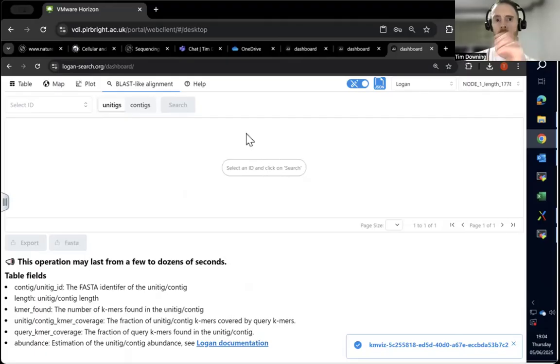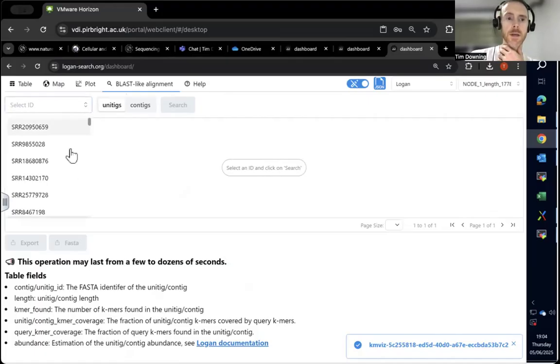So you can see how Logan can tell you more, and this is in addition to the other data in the other databases that are widely known, as well as the typical pathway level analysis that you could do. It's just a different perspective to harness the abundance of information that's available. And so you could take all these identifiers and do further analysis using information from those outputs as well.